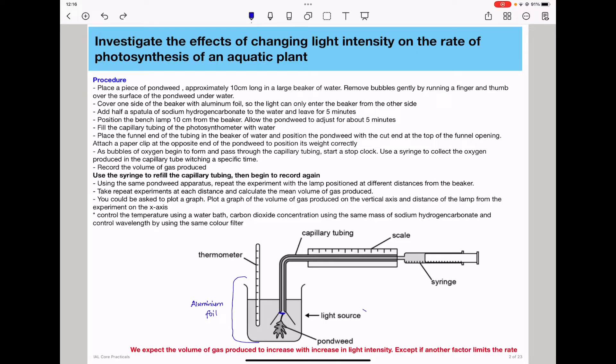So our suitable light source is going to come from this direction to ensure that we control the amount of light that the plant is exposed to. And since this experiment is about varying light intensity, we could position the light source at different distances from the experimental setup. Maybe you could begin with a position of about 10 centimeters and then you go to 15, you go to 20, and so on, so that the light intensity is decreasing as the experiment is carried out. Sometimes you could begin with a far distance and then move the light source closer.